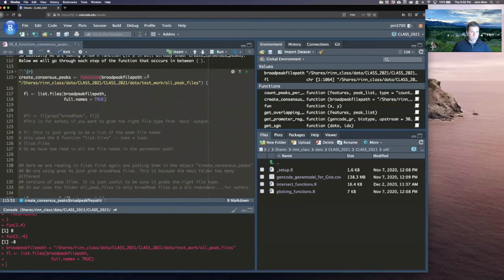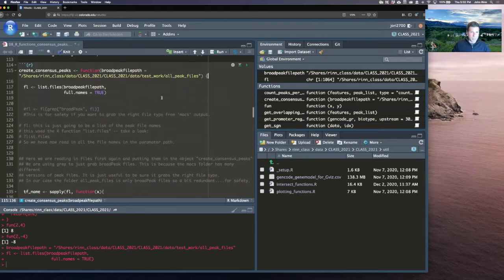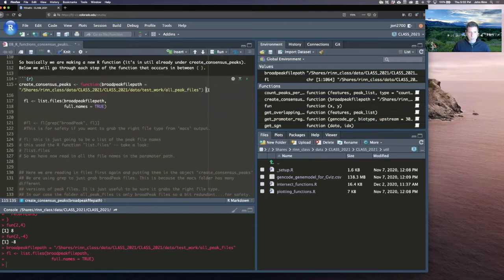And so it's important to remember we're inside of a function because of this curly brace here, but we can also have functions run inside of those functions. And that's what we're going to start to see here. In fact, you can have a function run, complete itself, and then still carry on what's going on in here.